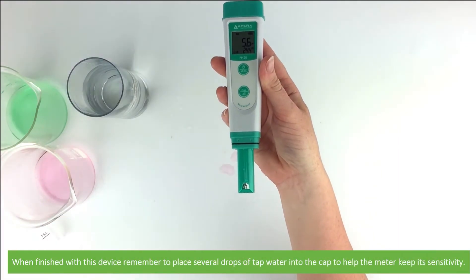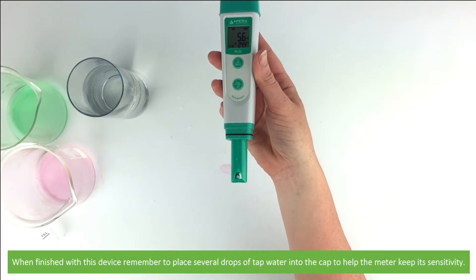When finished with this device, remember to place several drops of tap water into the cap to help the meter keep its sensitivity.